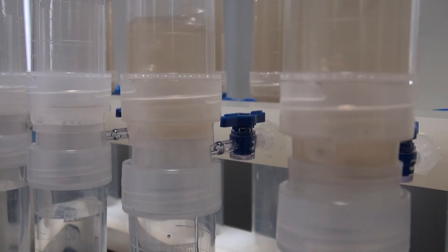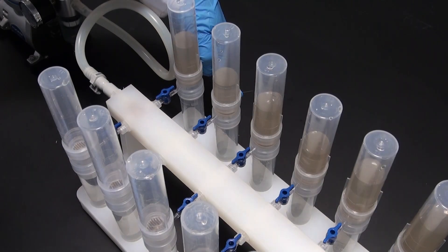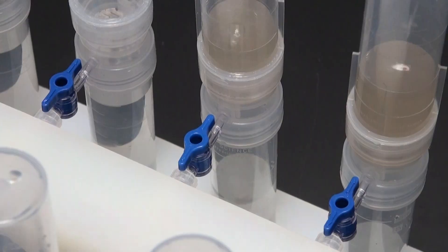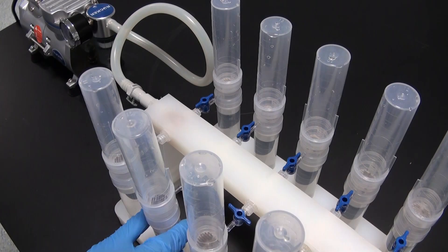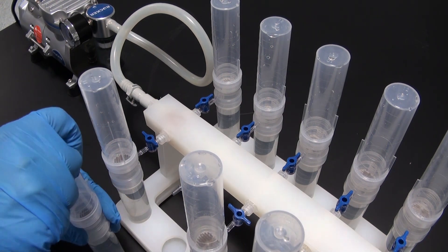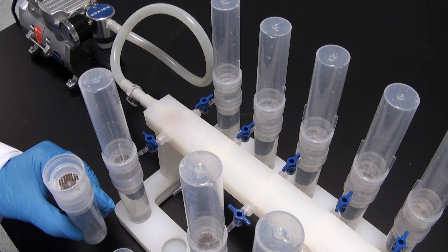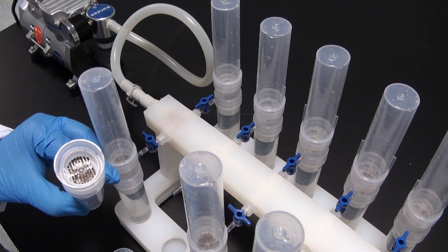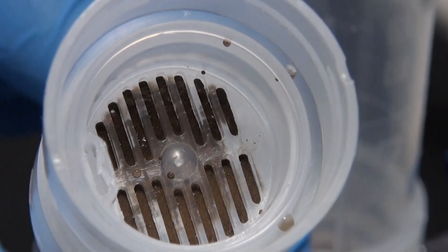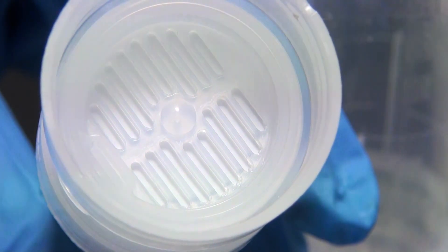Available in 0.45 µm and 1 µm hydrophilic Teflon membranes, as well as 0.45 µm metracel membranes, and 0.7 µm glass membranes for TCLP filtration. DigiFilters are available in 50 milliliter format and 100 milliliter format. The DigiFilter is an effective, disposable, trace metal-free filtration process.